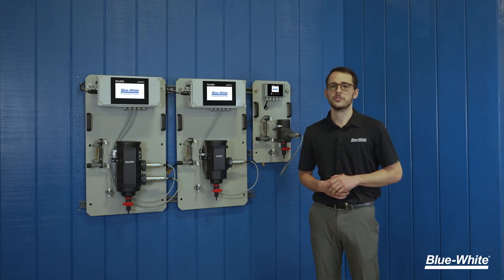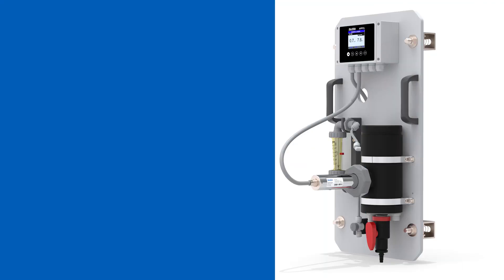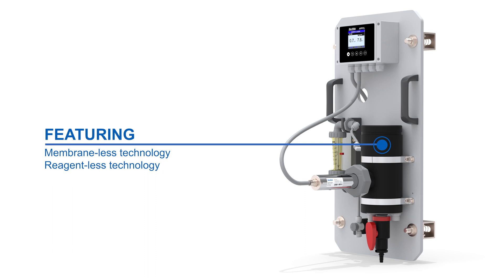Many analyzers on the market require expensive reagents, membrane caps, and service contracts to accurately measure your water. The APFCL features membraneless and reagentless technology, eliminating costly consumables and improving maintenance intervals.